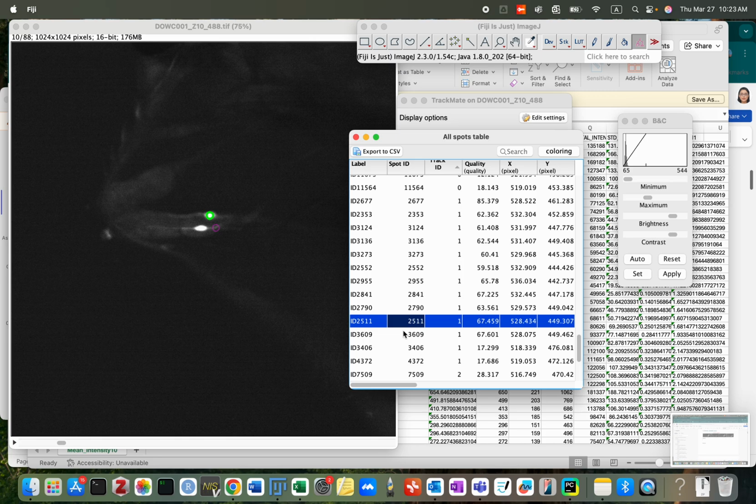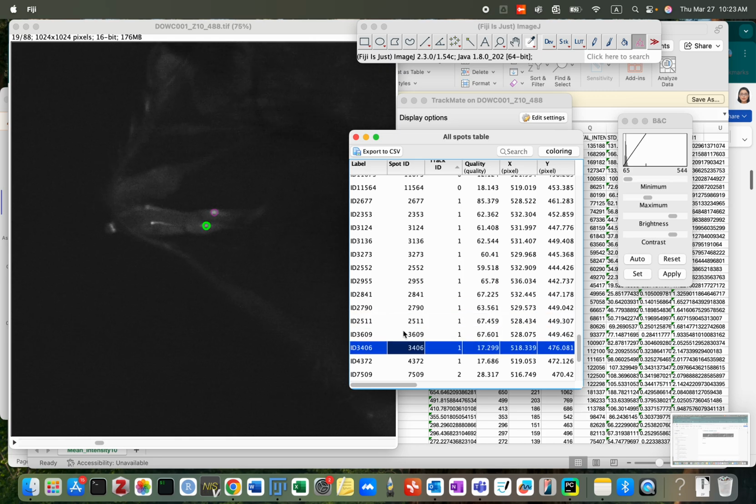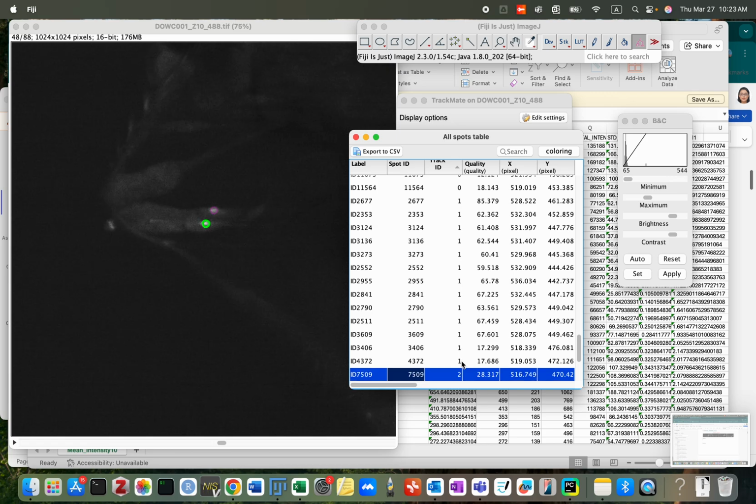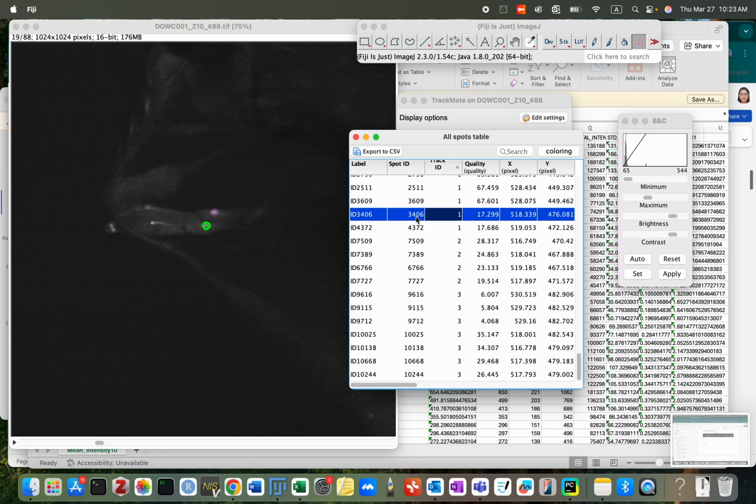And then come to this, this is wrong, 3406 until the checking ID, which is number 2, number 3. Those are all wrong cells, right? I think it starts from 3406. I need to look for this number.